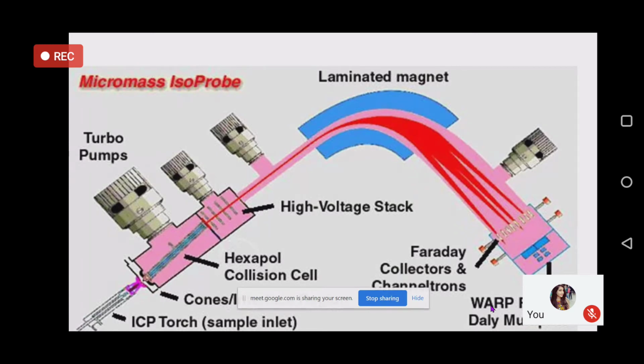So if you want all of them to reach the point where the electrode is placed, then you have to change the magnetic field so that for a given strength of the magnetic field, the equation which I showed yesterday is valid, and therefore the particles can reach the electrode.